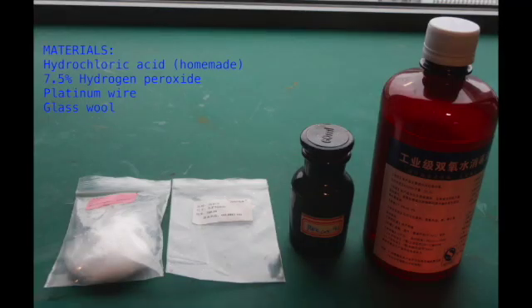To do this, we need a piece of platinum, the hydrochloric acid that we made last time, hydrogen peroxide, and some glass wool.